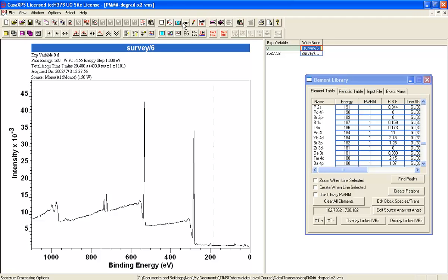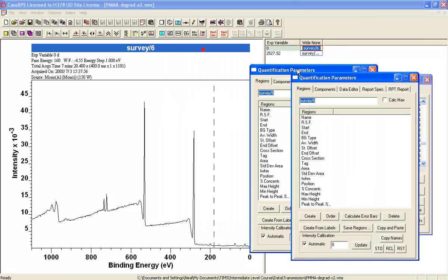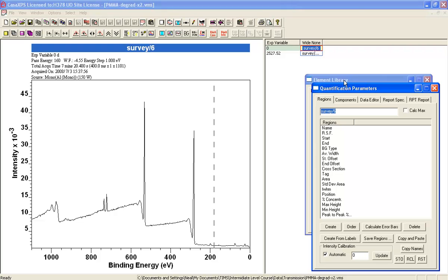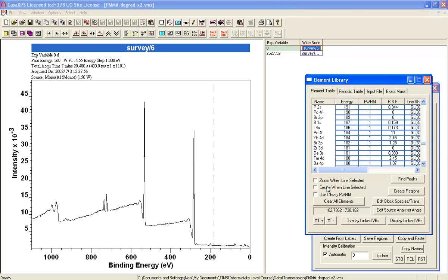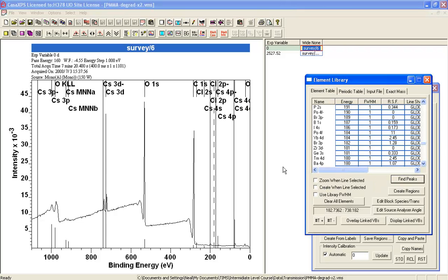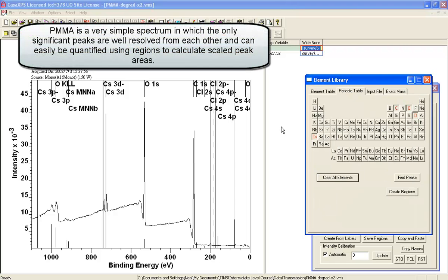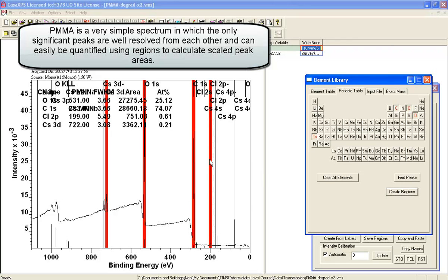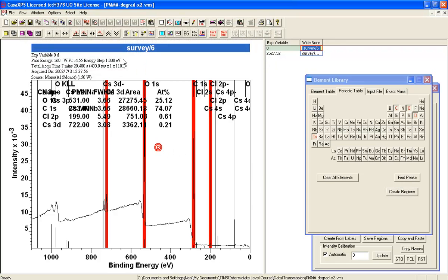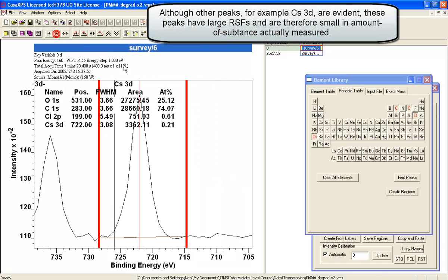I will create some regions using the quantification parameters dialog window. First, I'll say find peaks and evaluate what peaks we've got here. That looks about right, so let's create some regions and step through them to make sure everything is as it should be.